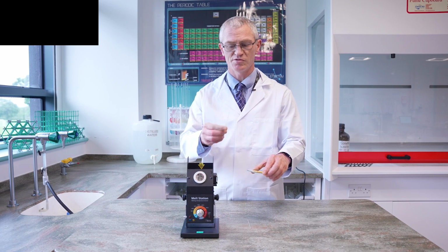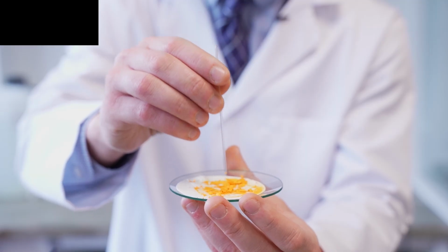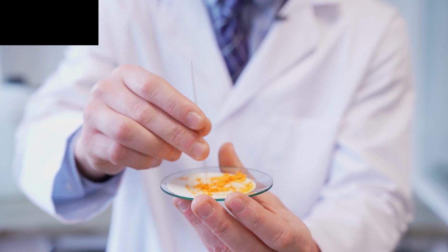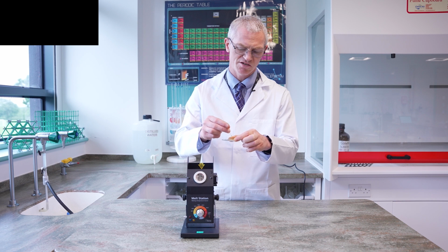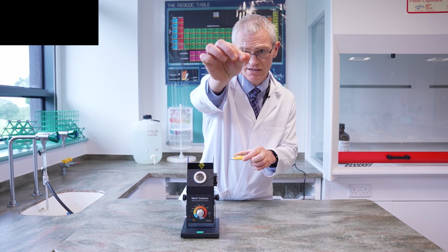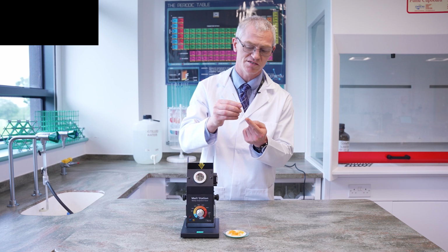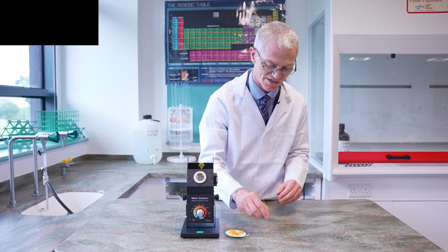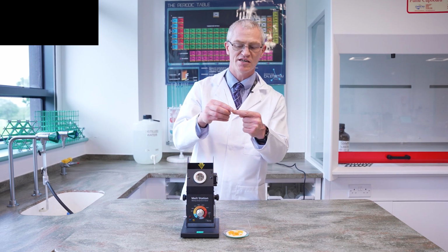A melting point tube is a bit of glass that's sealed at one end and open at the other. You take the open end and you literally just hit it into the solid, and so it goes into the tube. You can see here that it is in the tube. Then all I do is turn it the other way, so the sealed end is here, and then just start hitting it on the table. I hit that very, very gently, and as I keep doing that, the solid falls down the tube and ends up in the end of the tube.